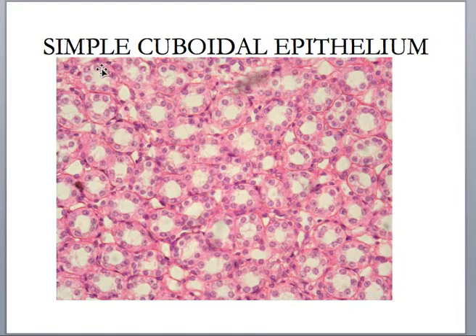So here, this is a kidney tubule, there's just lots and lots of them. Each one of these tubules on the outside would be the basement membrane, and on the inside right here, where you see this hollow space, this would be the lumen, where the secretions or something is flowing through. This would be the apical space, right? It's open to the outside, right?